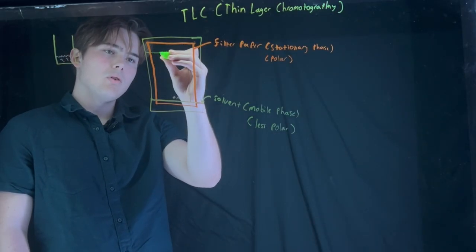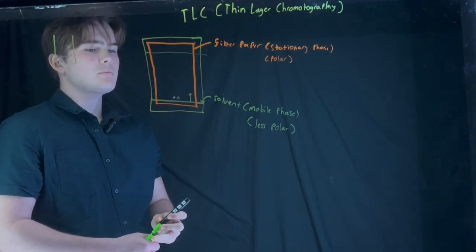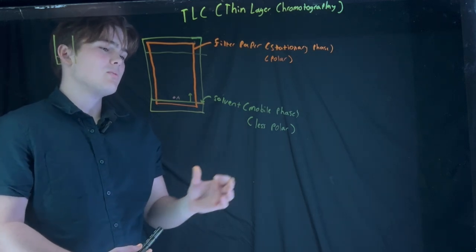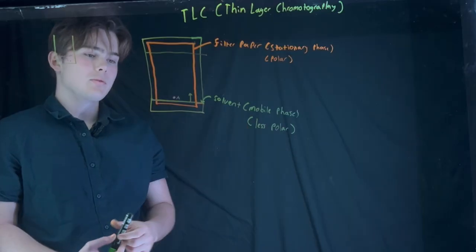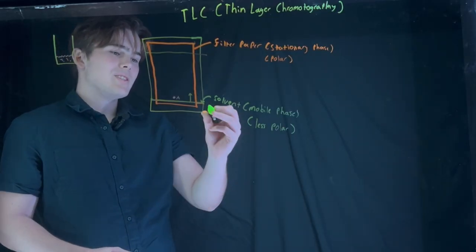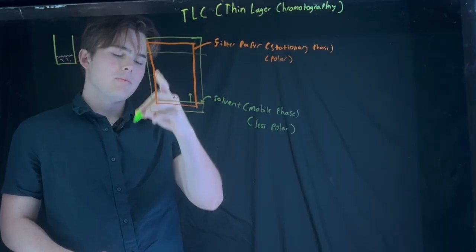Let's say it moves up to this point here. The distance that that solvent travels is going to be associated with the mobile phase.